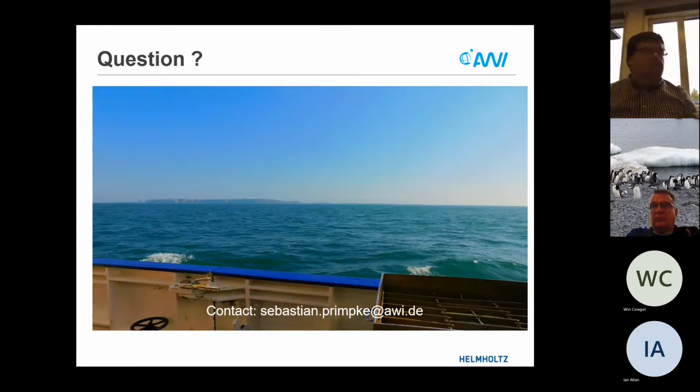Right. I think it kind of highlights that in terms of research for FTIR, we're still in the research, development, and exploration phase. For any query that someone says, I'm not really sure about the spectra, rather than brushing it off and saying, oh, it's just this, it's just something silly, it's important for people who've got the time to investigate further, if possible.